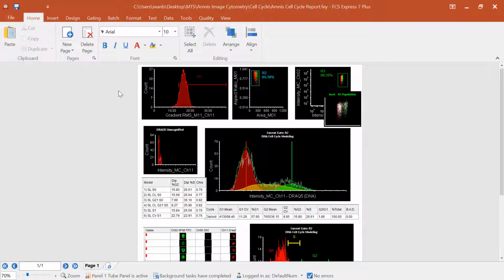So it's used almost ubiquitously for identifying a cell, and almost every experiment that you're performing with image cytometry is using some sort of DNA dye to identify a cell, segment that nucleus, go out and find cell boundaries from there, or find sub nuclear compartments. So most of the data sets you're working with have this component.